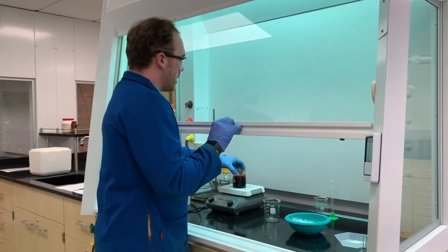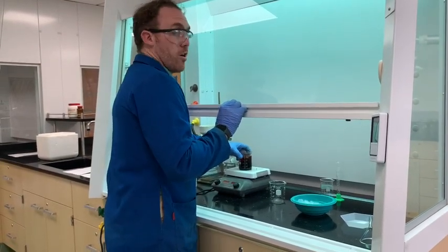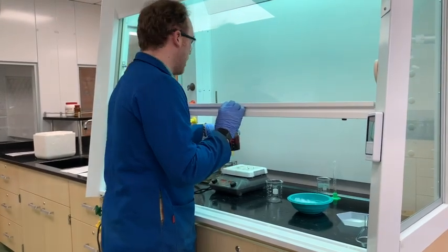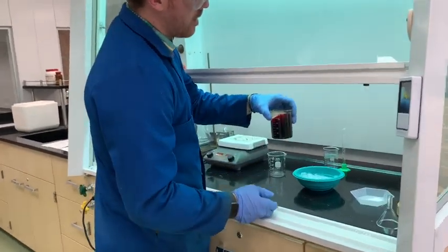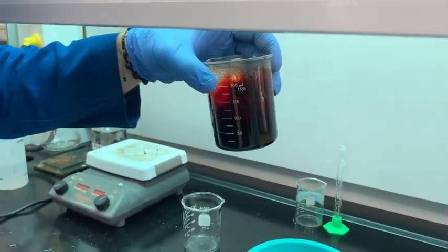So it appears that we've already mostly dissolved this azo dye. It's really hard to tell because it's quite concentrated, but you can see that it's very dark, but it's very homogeneous in terms of its texture.